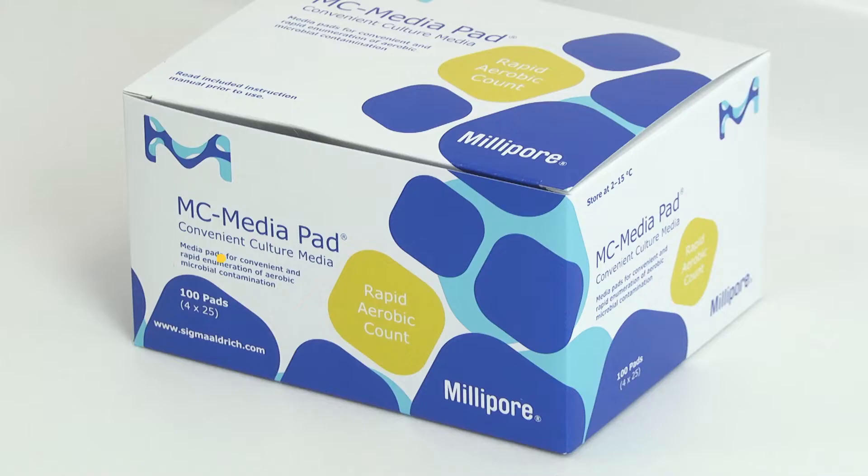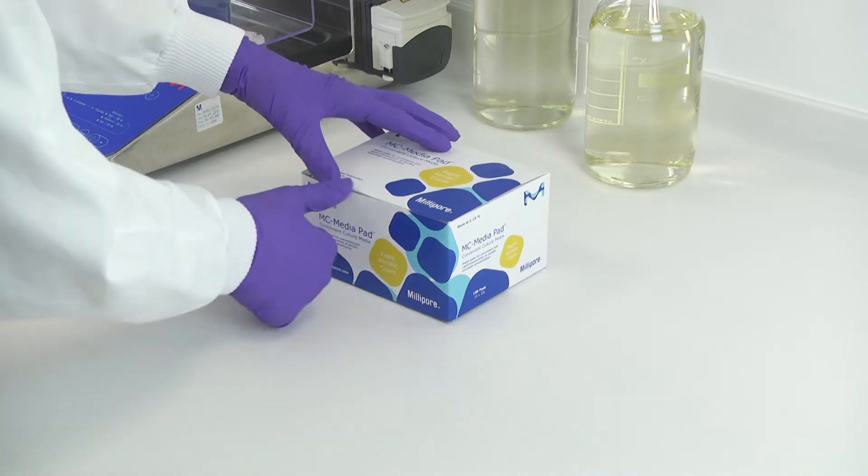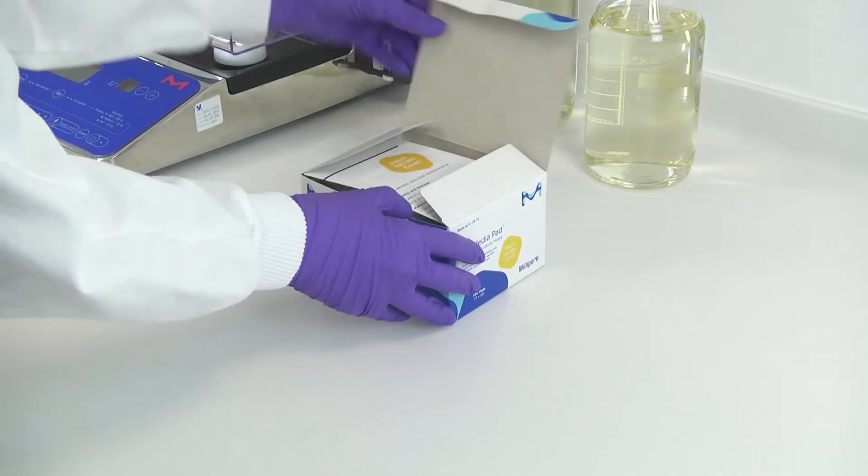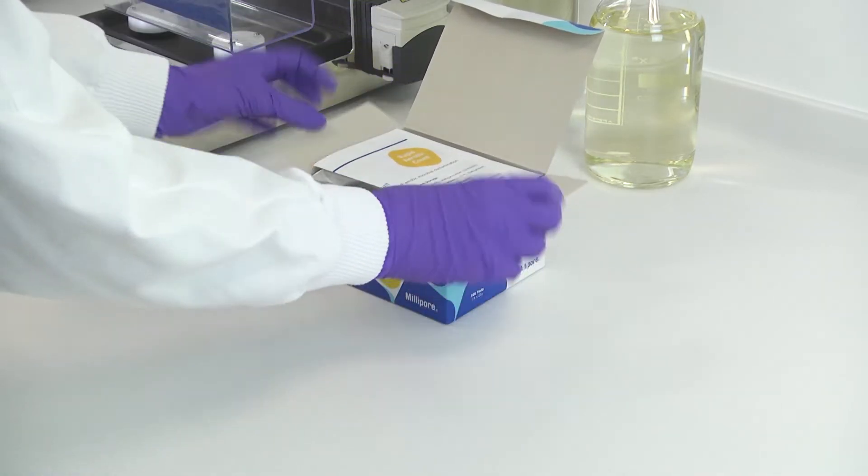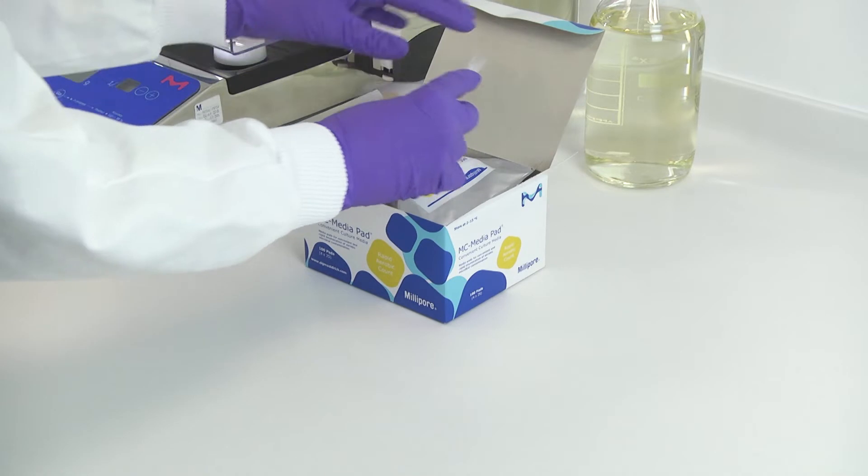The MC MediaPad is available in a package of 100 pads. One box contains 4 aluminum pouches with 25 pads in each. Instructions for how to use the product are present in the box.